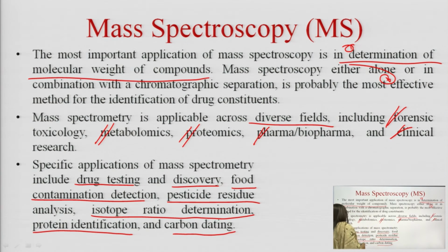See, isotope ratio determination is also of immense importance in phytochemistry, as here we are working on natural molecules which should be bioactive in nature, and as already suggested, not all isotopes are biologically active, only some, one or two isotopes, sometimes other isotopes.